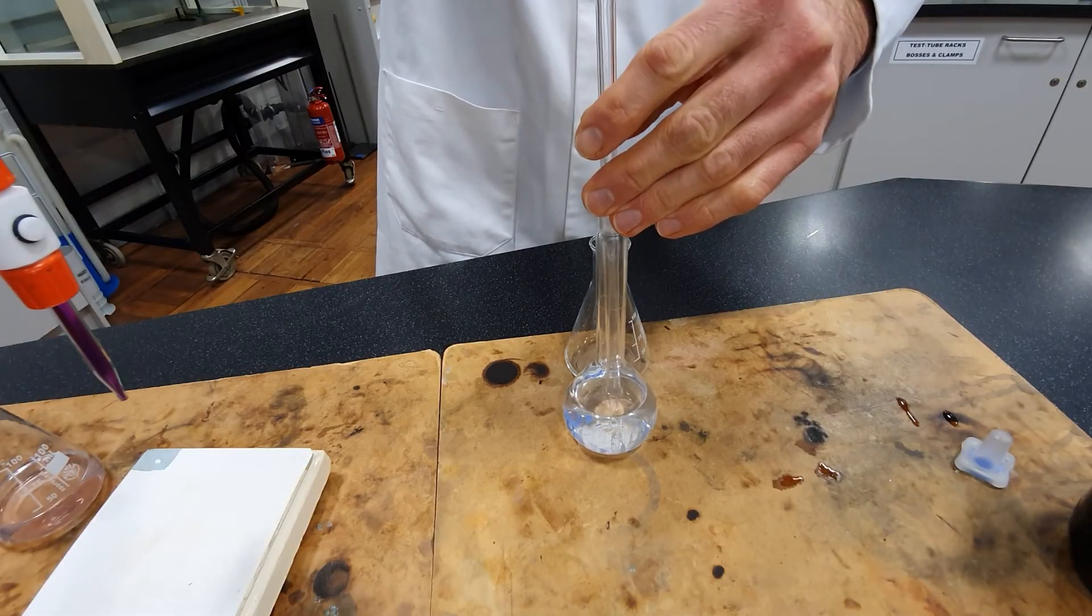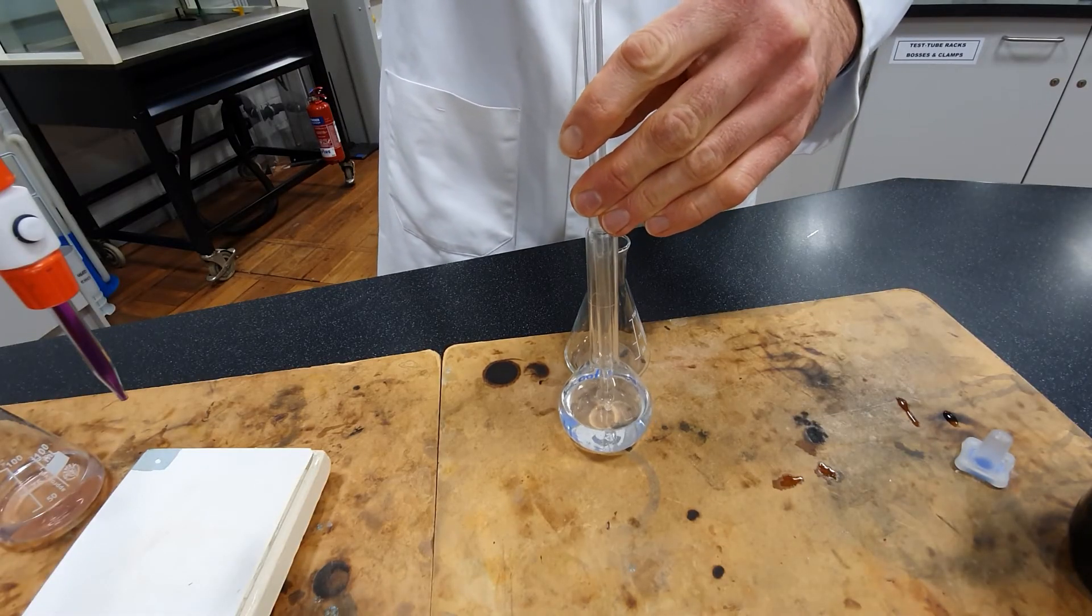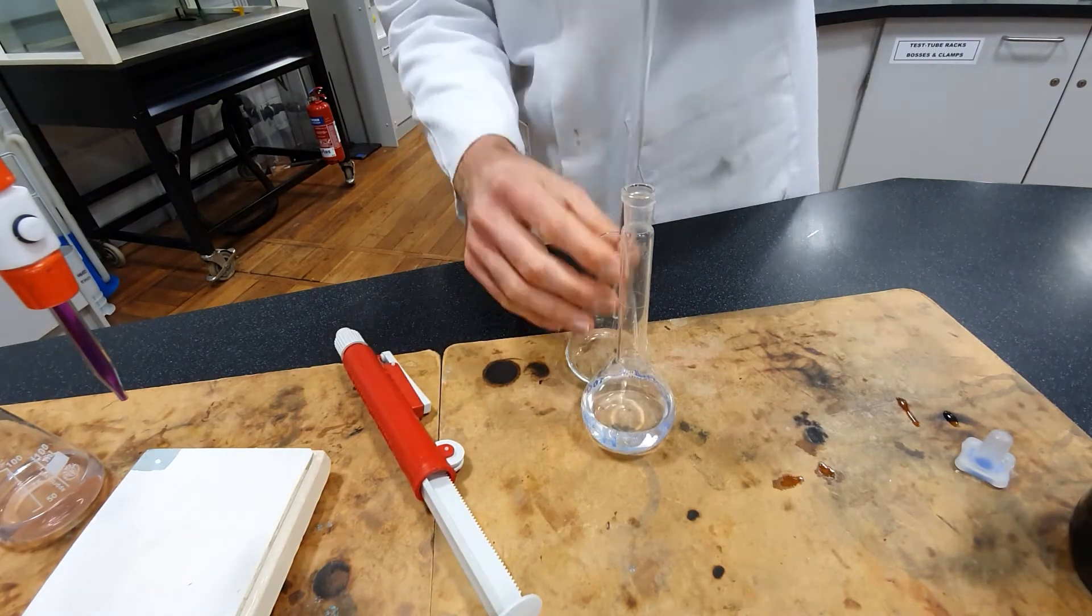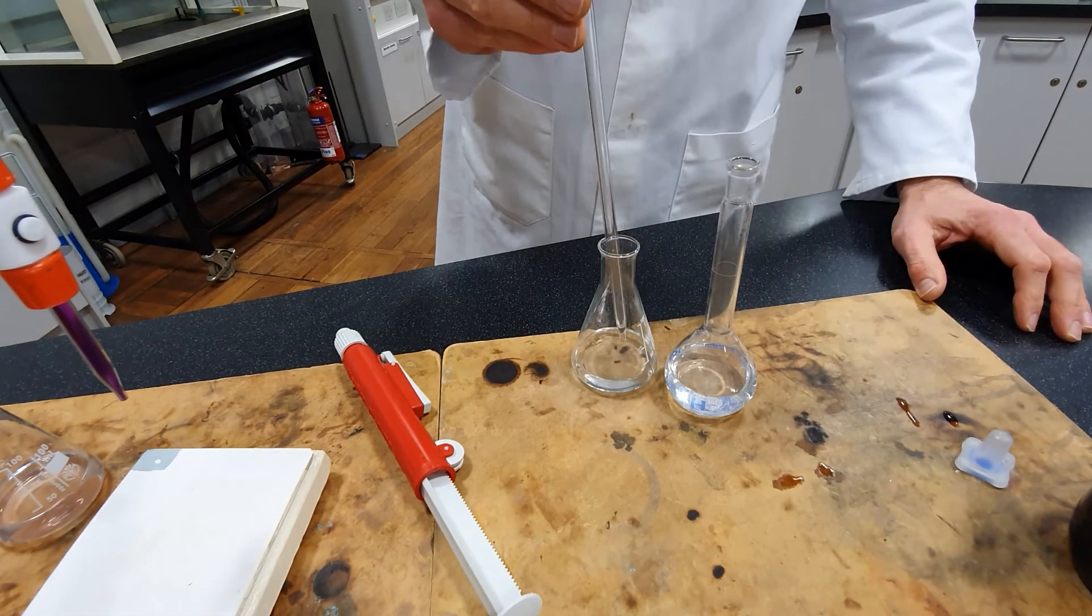Let's have a go at a second run. Hopefully this one will be a little more accurate than the first. 25 cm³ of the iron solution. Record the volume of the manganate solution at the beginning of the second run.